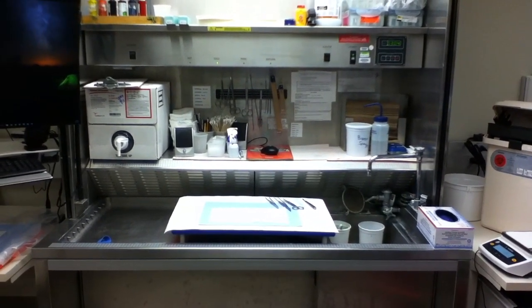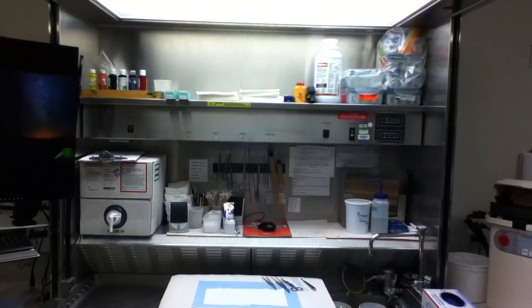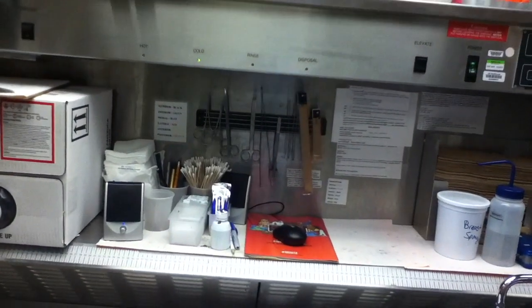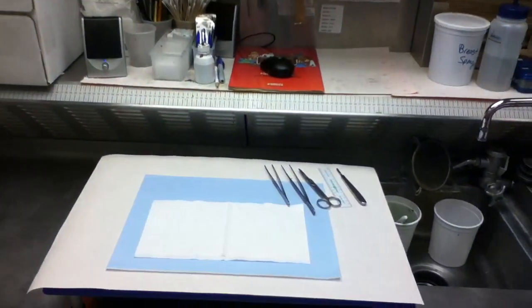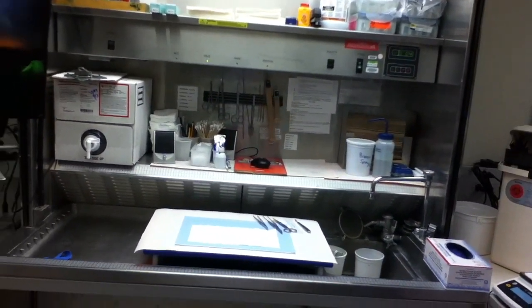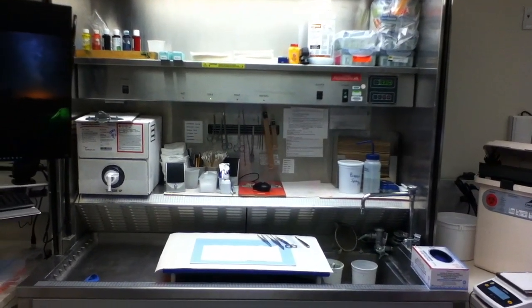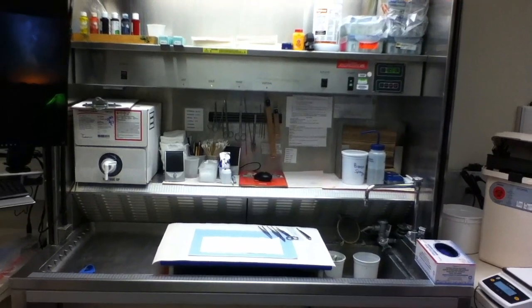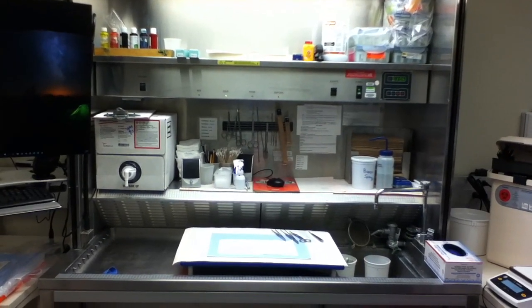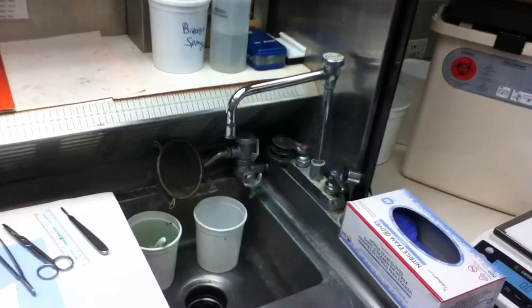What I'm using is a ThermoScientific Gross Lab Senior. It comes with a sink, a rinse vent hood that I've got turned off now, and a little magnet strip in the back. Mainly it's a well-lit stainless steel grossing bay that has elevation features — that's important particularly when you're tall or short so you can actually customize the grossing bay to the proper height.